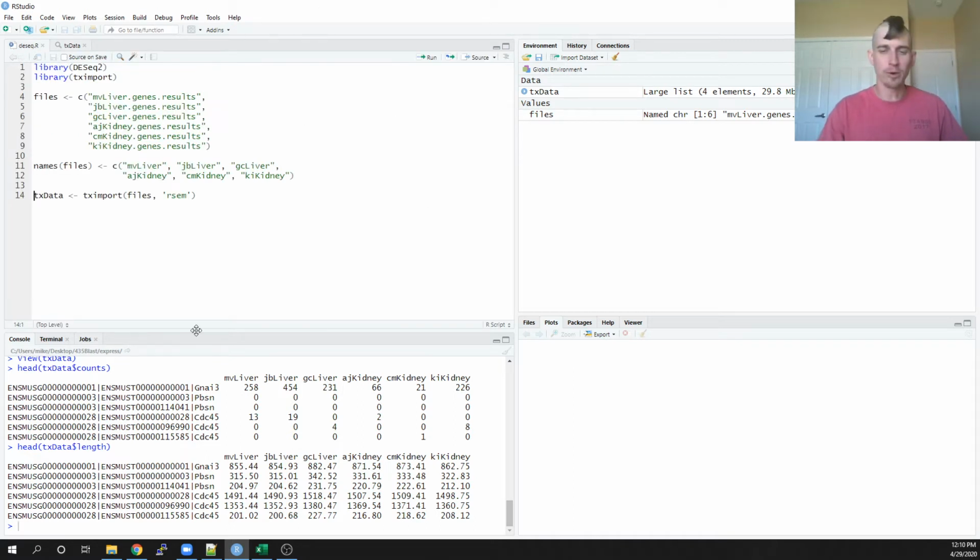All right, but there is a stupid problem that I had to find out how to fix. It's that some of these lengths of our genes, and it's just a property of the mouse CDS file. If you recall, some of the shortest sequences I have in my mouse CDS file from this Ensembl data are only like 3 nucleotides long, and that actually will reduce down to an effective length of 0. And not RSEM, but DESeq will complain if I'm going to have sequences that are of length 0.